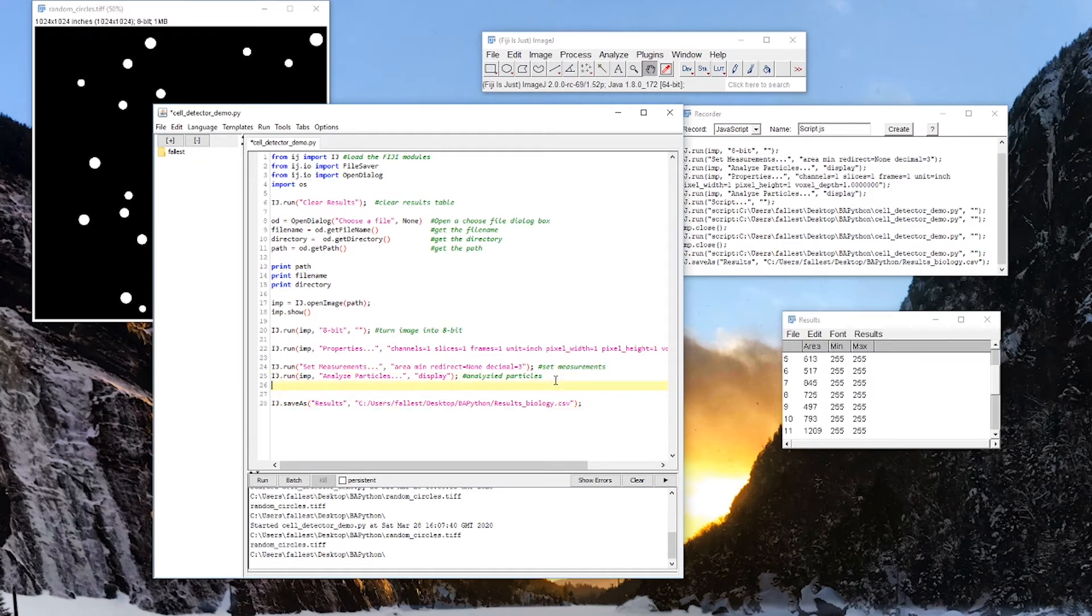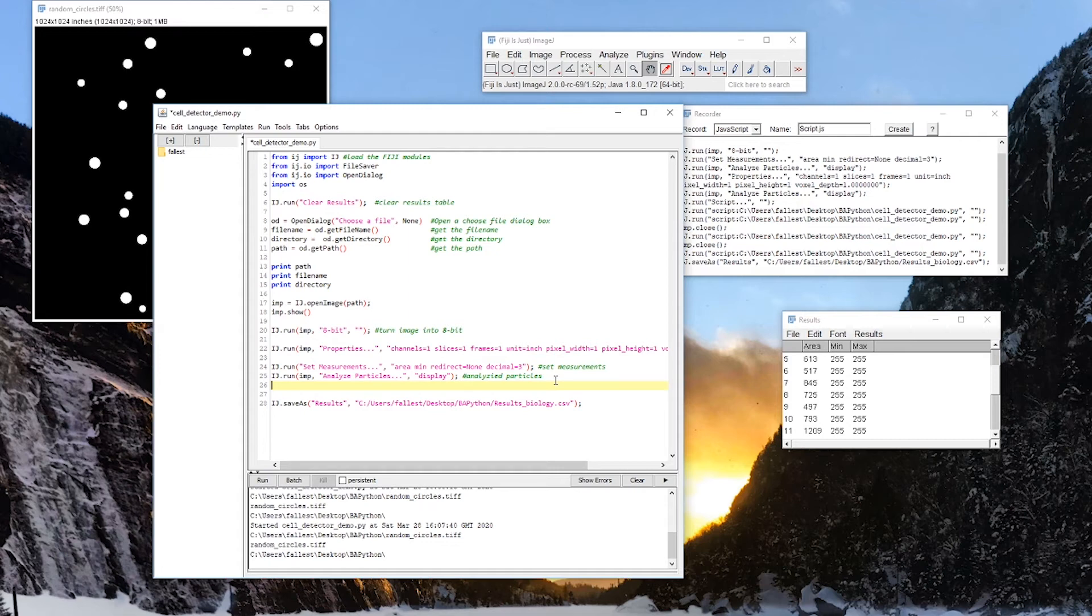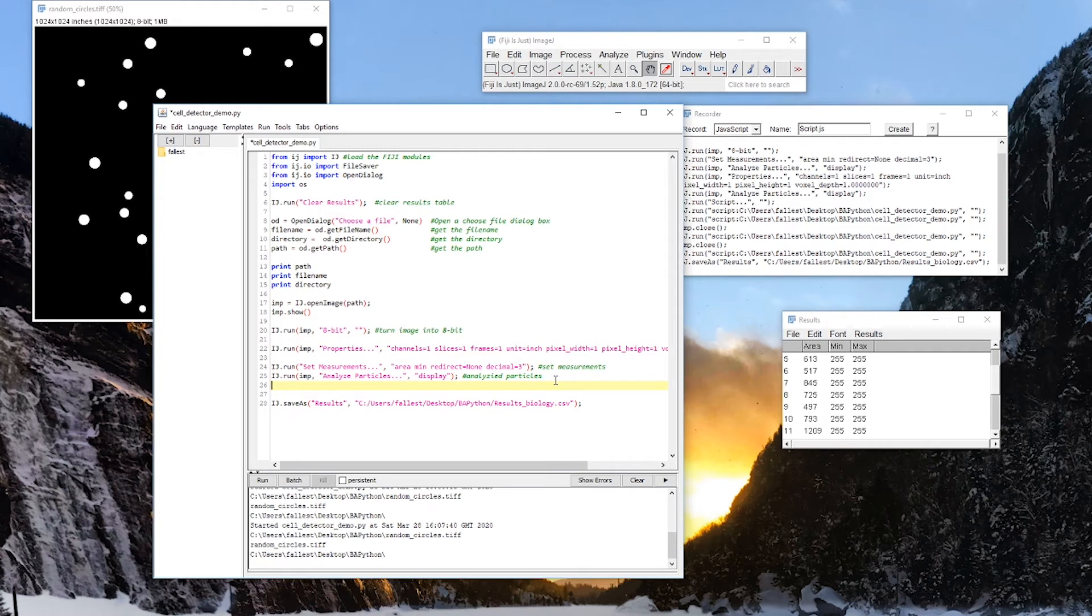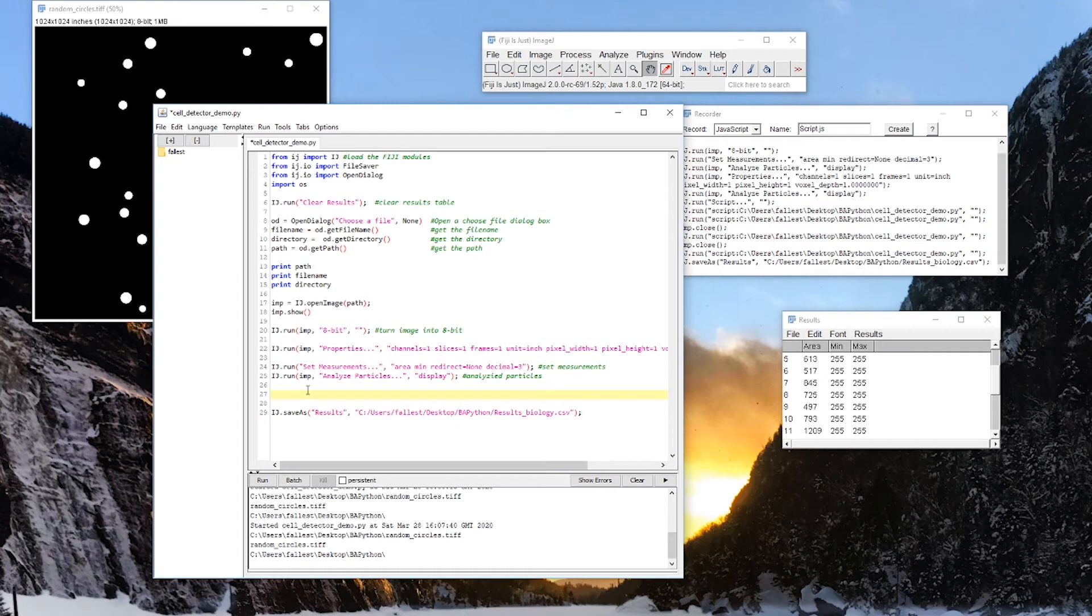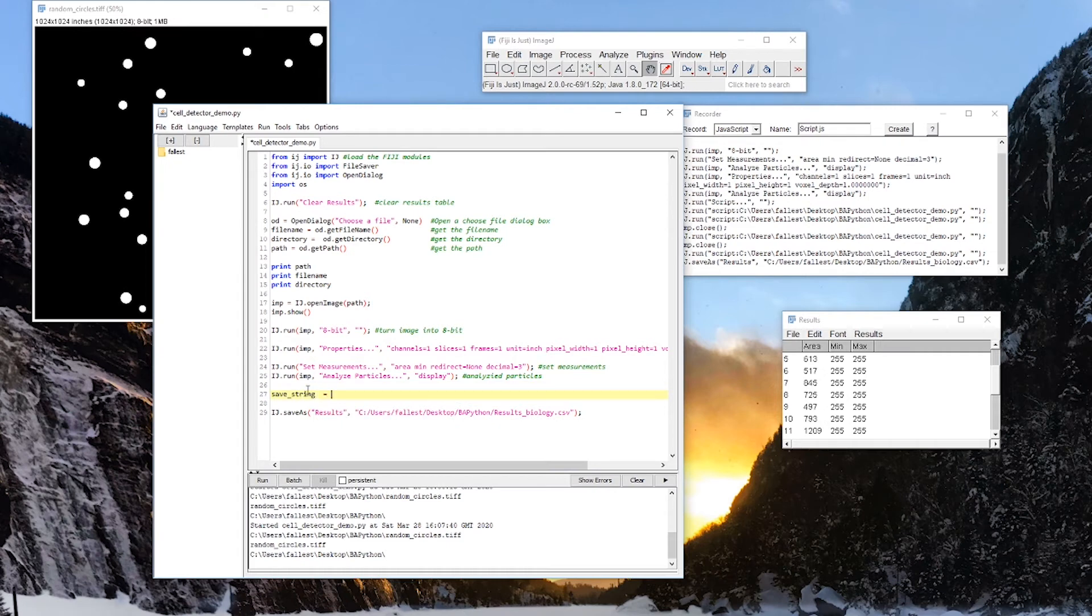But I don't want to necessarily have it being saved into C, colon, users, desktop, python, results biology every single time. I might be writing the script from something else. I might not have these folders on my computer. You probably don't have the same username as me. So how can we get around that? Well, we already know from here, when we did print directory, that we have a directory. So we can make a string. Save string. And we can just save into the directory that we pulled the file from. So save string is going to be directory. Plus. This is a string concatenation, like we've learned earlier in the prerequisites.